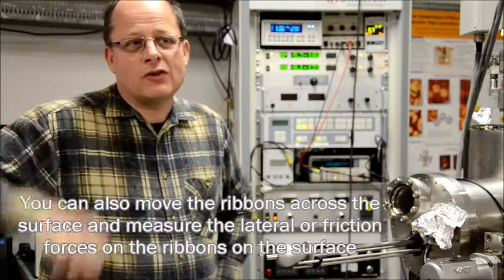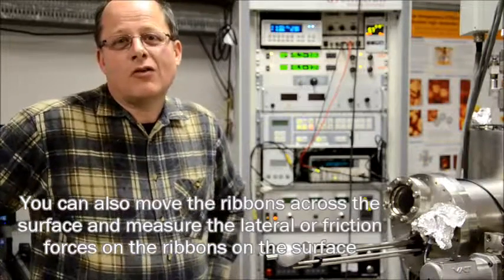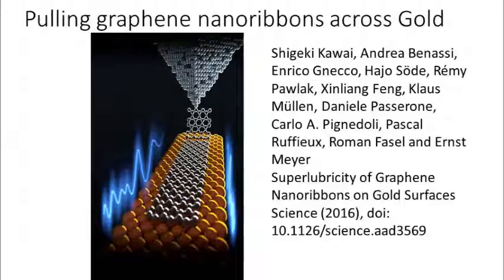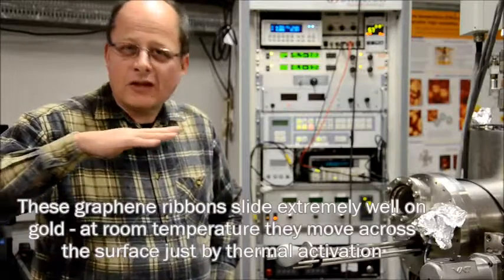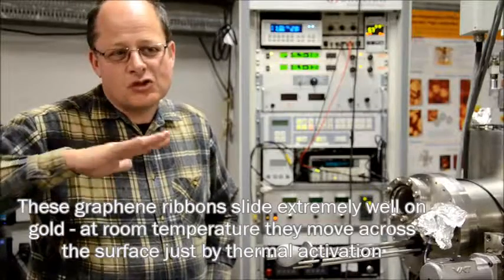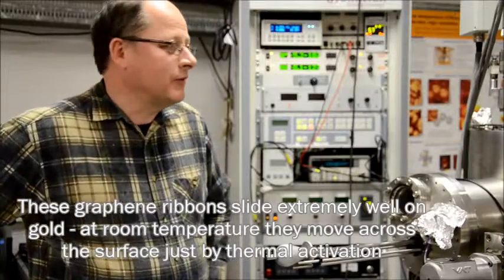So in that sense you can study friction, or in this case even the very low friction, also called superlubricity. So it turned out that these graphene ribbons are sliding extremely well on gold, so they can move practically with nearly no force. At room temperature they will already, by thermal activation, move around on the surface.